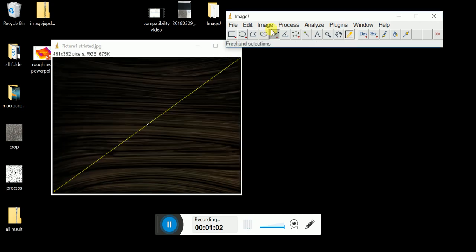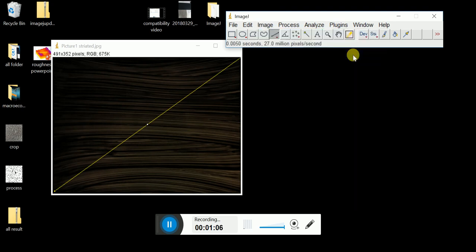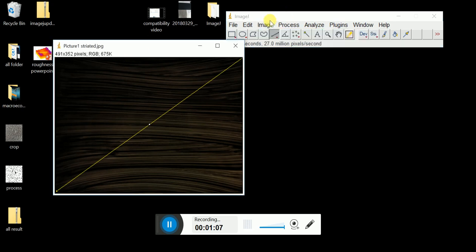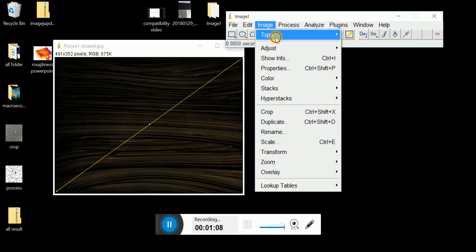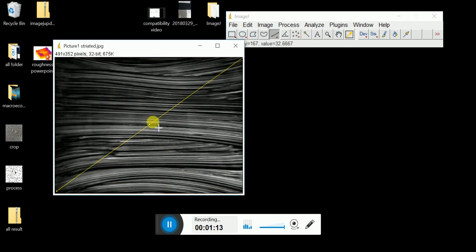After that, go to Image Type and go to 32-bit. You will see that the whole picture will turn whiter. So these are the striations you can see, these are the roughness you can see.